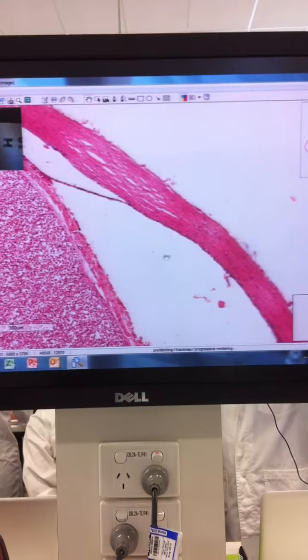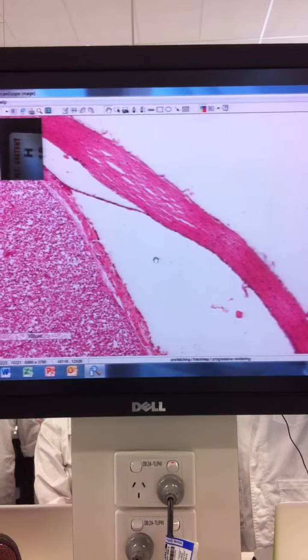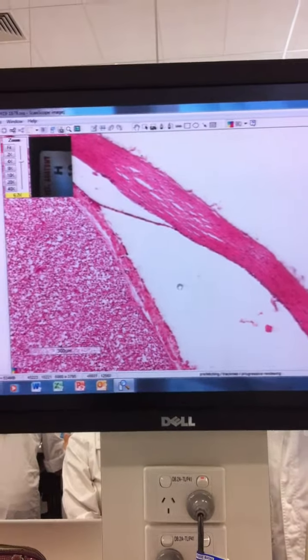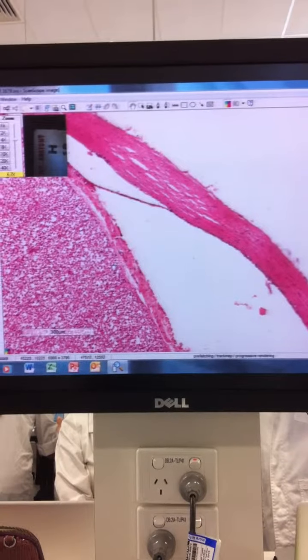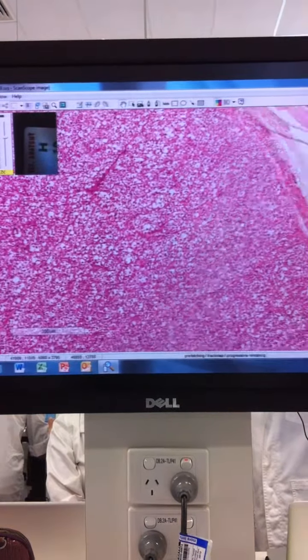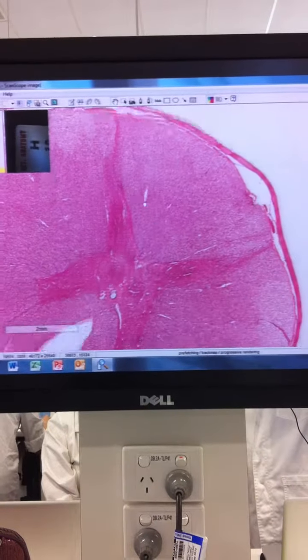And then it's into this space here, which can be probably slightly bigger in the spinal cord itself. You're looking at a spinal injection or a subarachnoid injection, same thing. Then, we'll just look a bit closer at the grey matter. I'll just come out a bit. So you can see that butterfly shape.